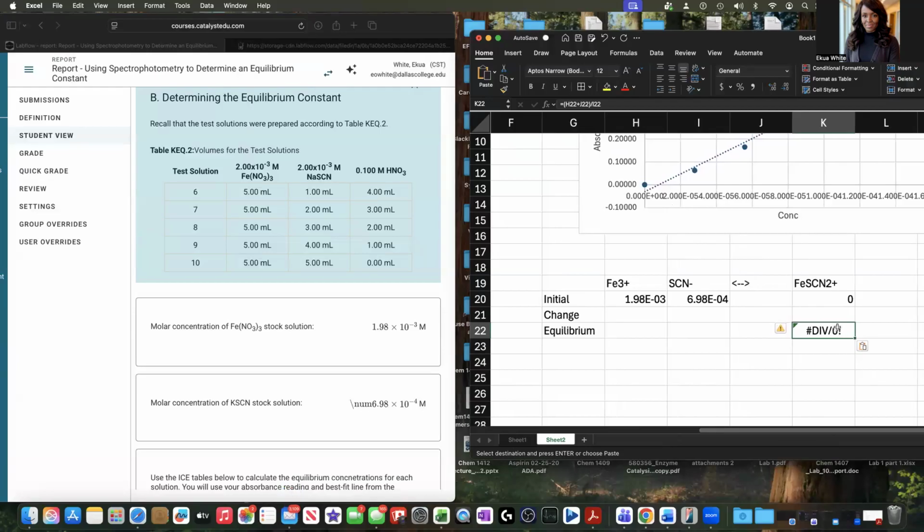So I'm going to write the number here, right? It didn't work when I copied it over. The number is supposed to be 2.343 exponent. Where's the exponent? Oh, exponent. This is capital E minus 5. Okay. So when I put this number here, this is technically x.